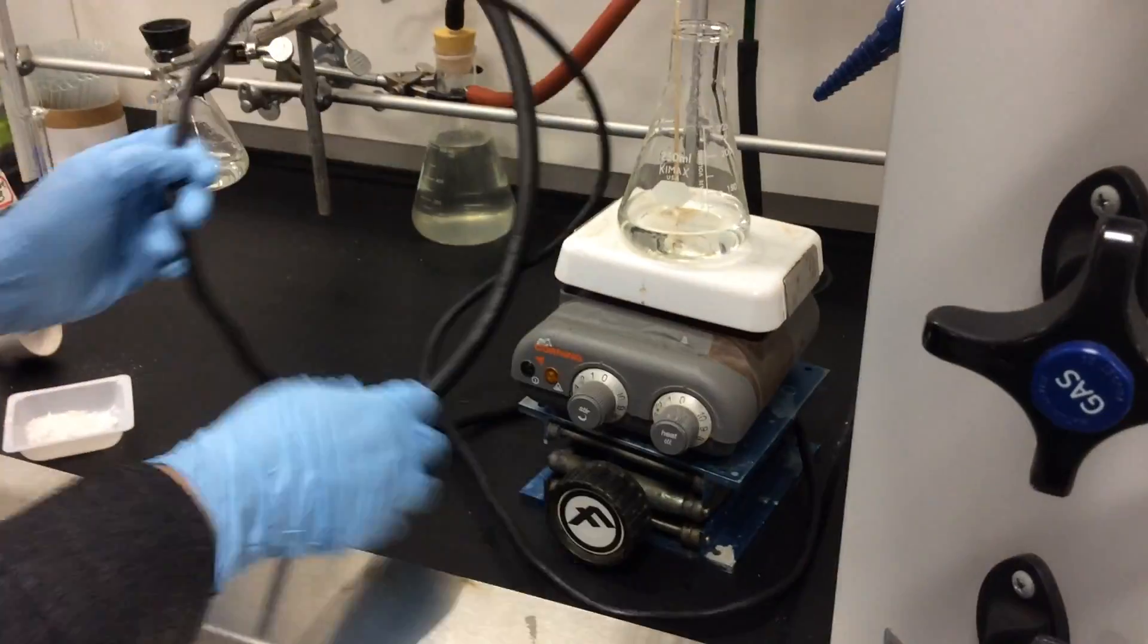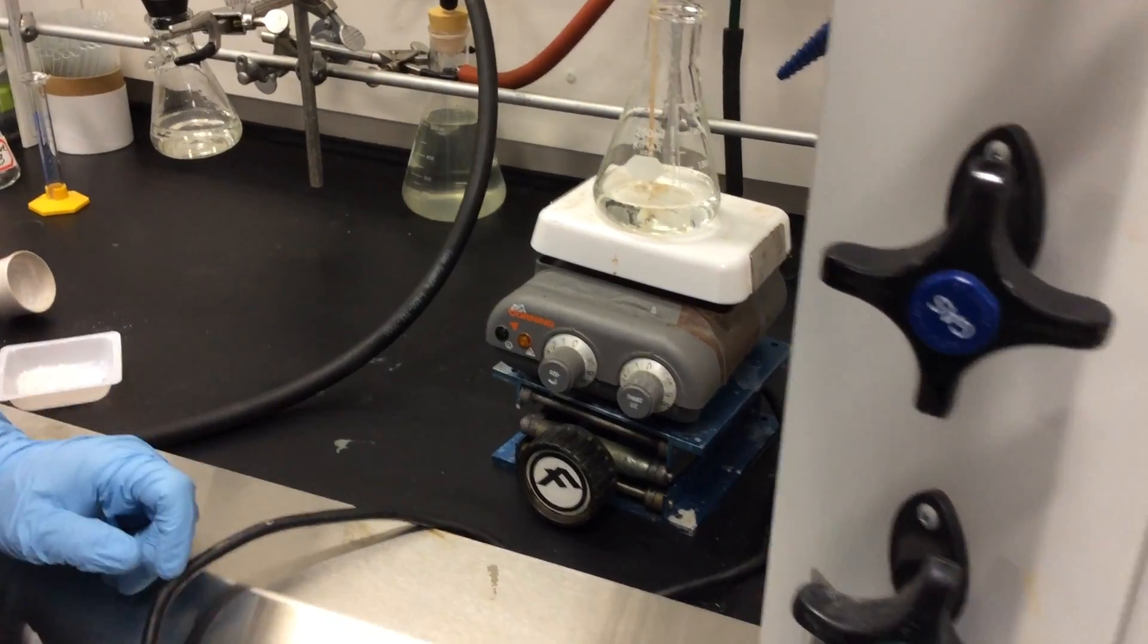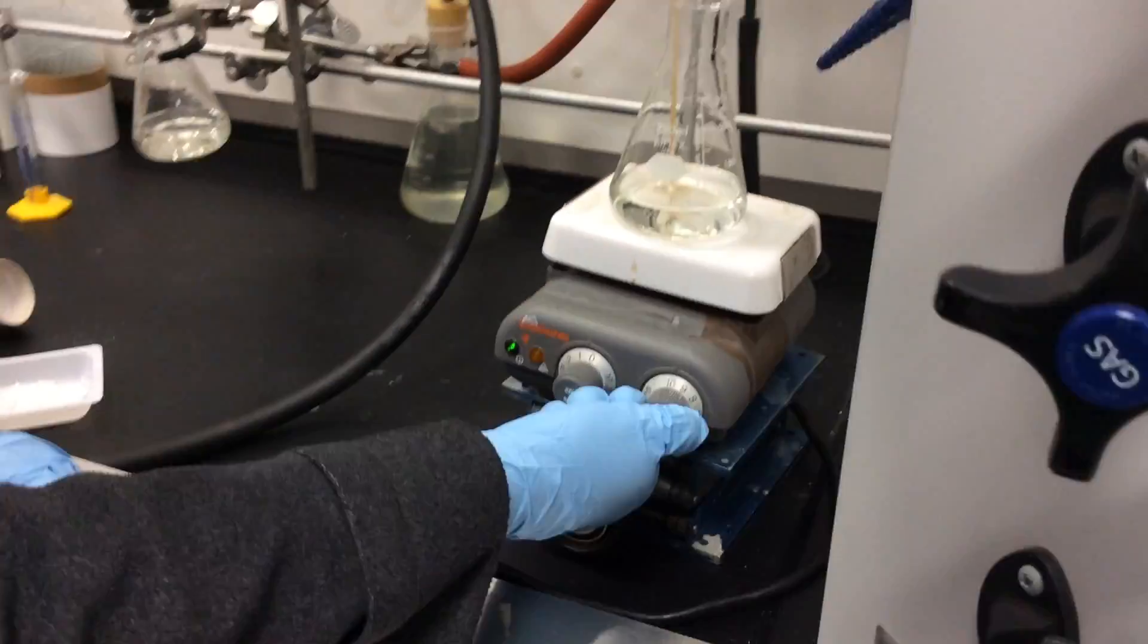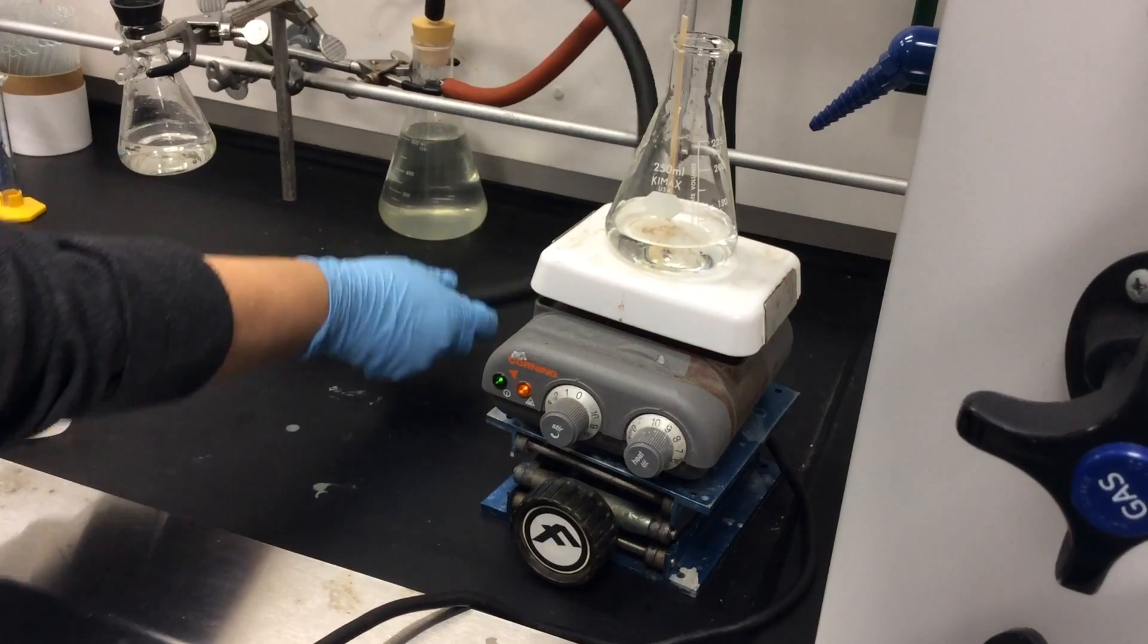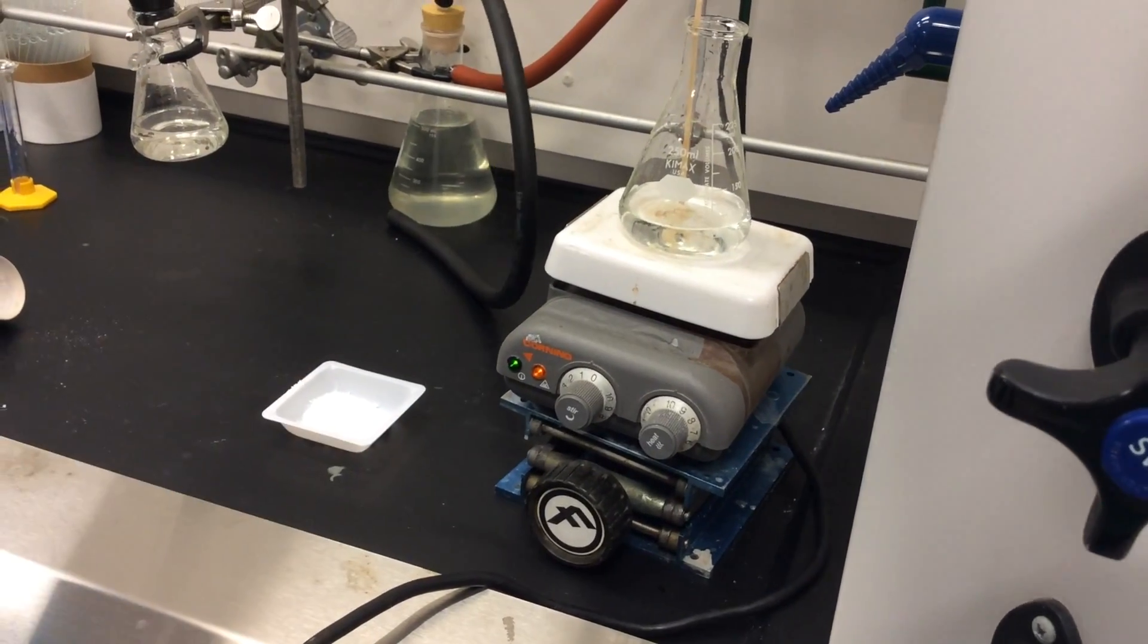We're going to put it on the hot plate. Don't forget to plug the hot plate in, otherwise it won't heat. Turn it to high. And we're going to just let that heat to boiling. While we let that come to boil, we can now take our dirty glassware to the sink to wash.